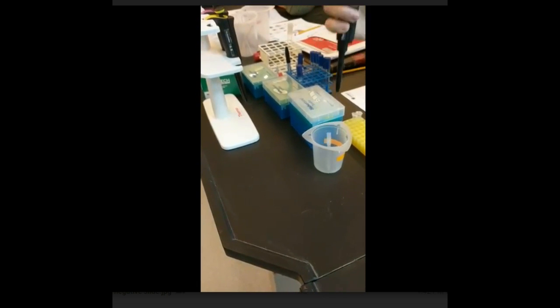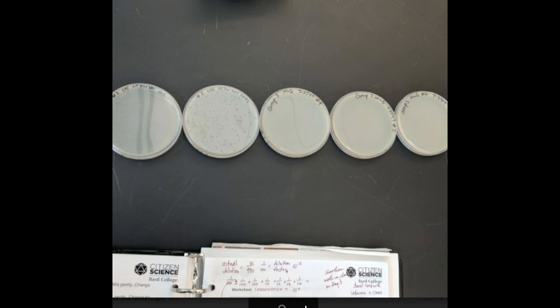So remember we talked about how tryptone broth was Gatorade that wasn't quite as good as LB broth. Label your tryptone agar plates 1 to 7, including your initials and date. Pour 4 milliliters of top agar into each of the 7 prepared sample tubes.